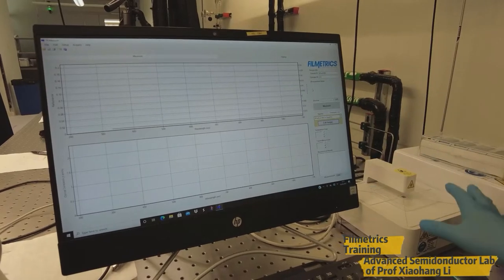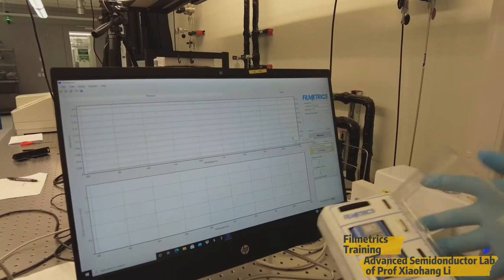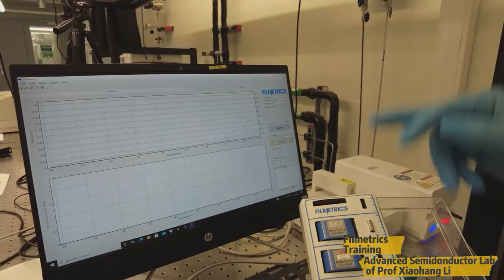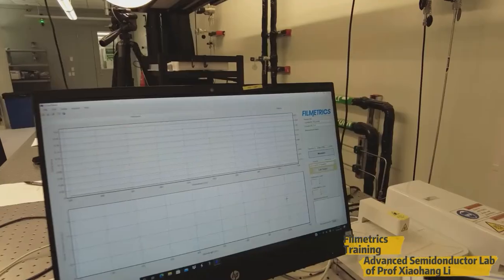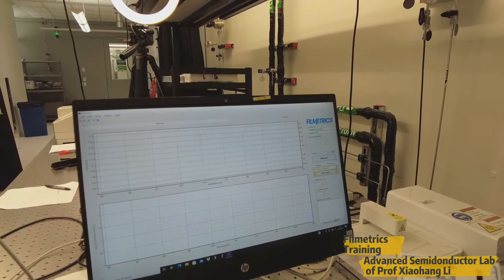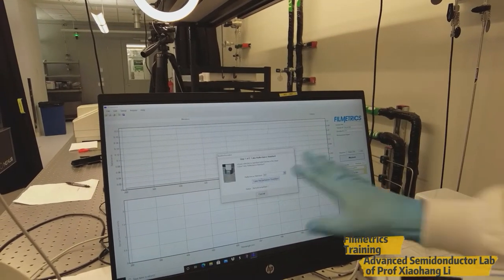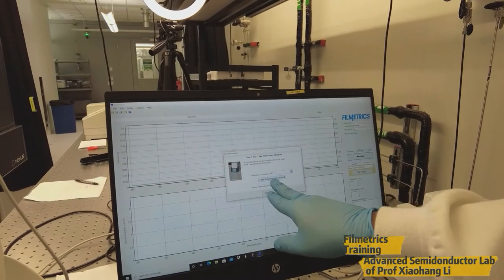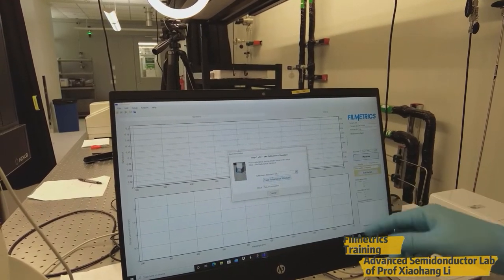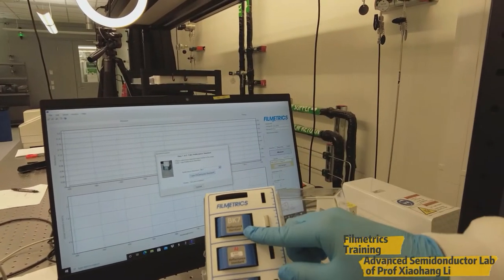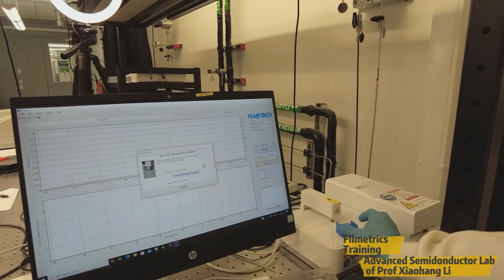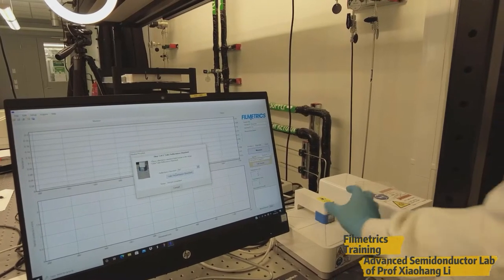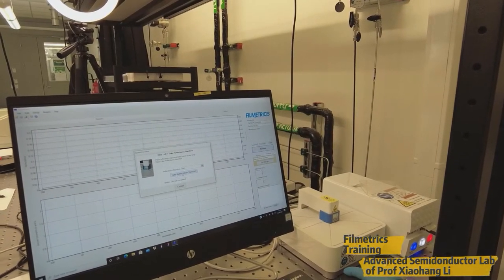First of all, we need to calibrate the system by using the standard samples. So these are the standard reflectance samples. So we use one of the samples to calibrate the system. For that, we need to measure the baseline. So go this baseline measure. So after clicking this baseline, it will pop up this window. So we need to take this BK7 as a standard reflectance. Place this standard sample here and click take reflectance standard.